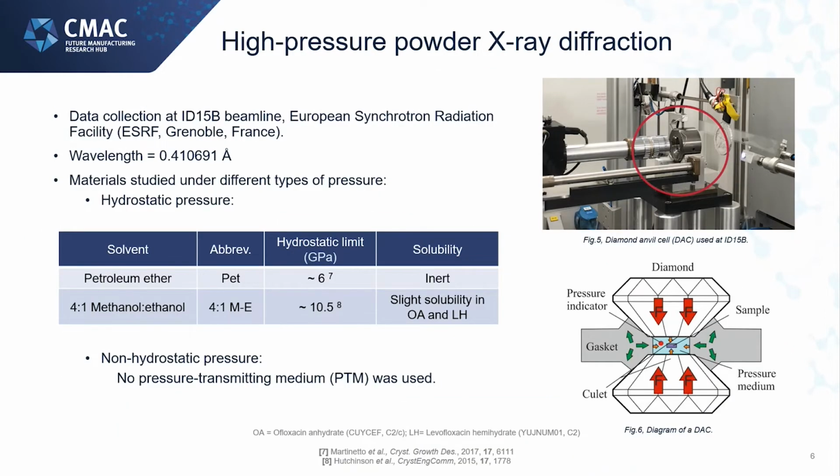To look at these materials, we went to the European Synchrotron Radiation Facility to carry out some high pressure powder X-ray diffraction.